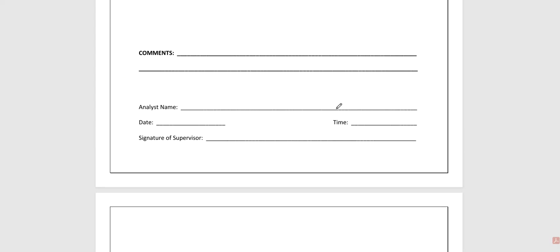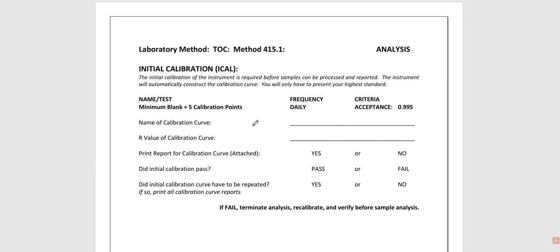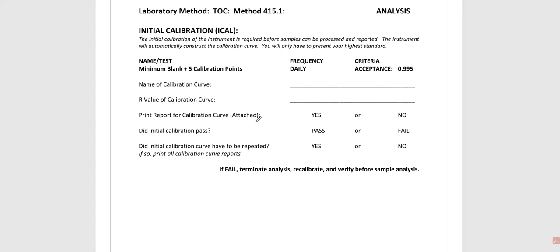As before, comments, name, date, time. Supervisor looks over it, making sure that everything's okay. Next up is the analysis. Once everything gets ran, I got numbers. We need to figure out, do these numbers make sense?